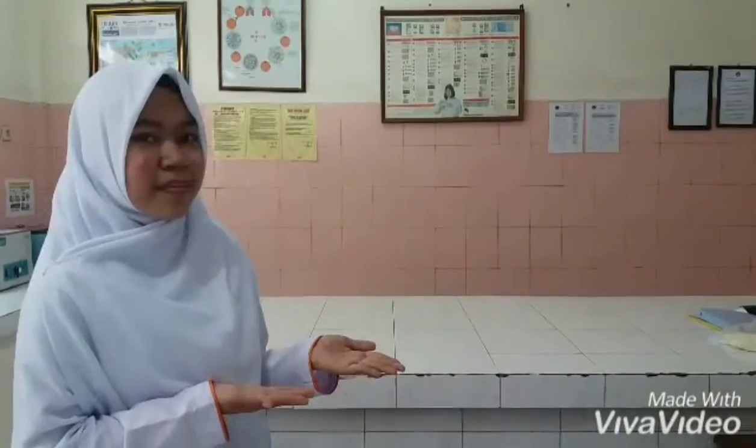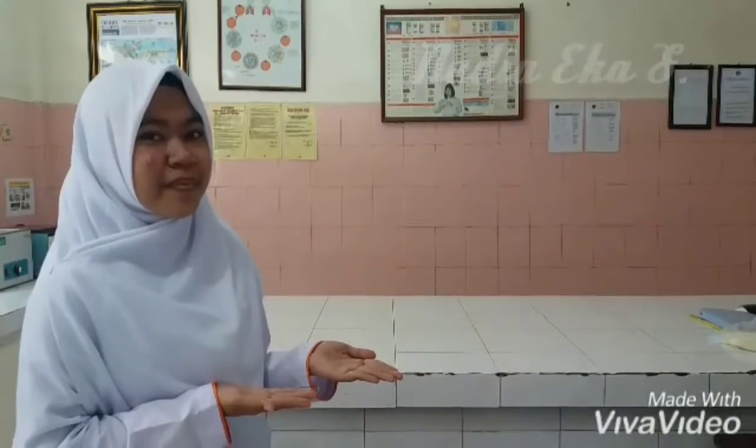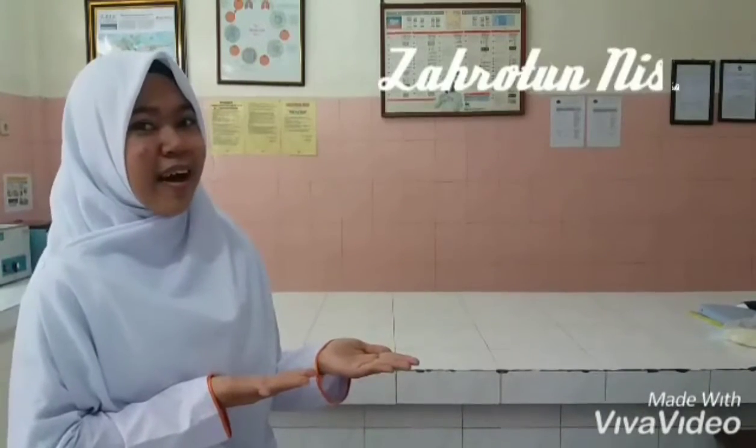Today our group will practice acid fast staining. But before that, let me introduce our group members. First, me, Ifana Rizkiyah. And this is Gusti, Naila, Rachmawati, Gufron. And this is Nadia, Eka, Sripuspita. And this is Zahrotun, Nisa.